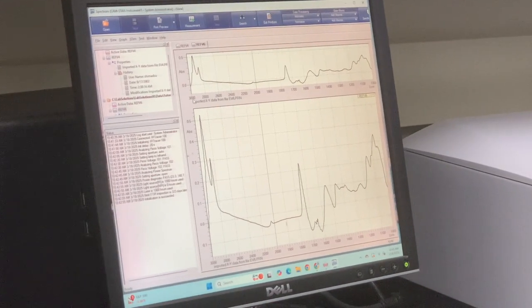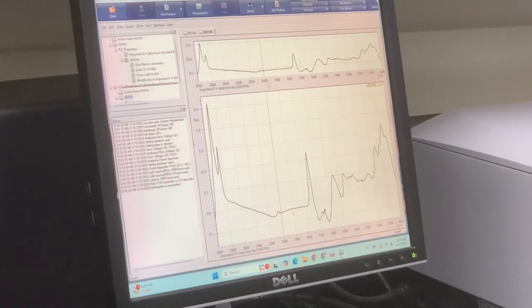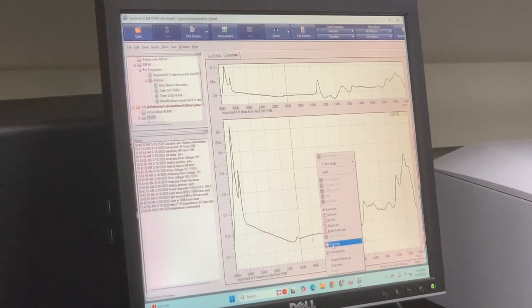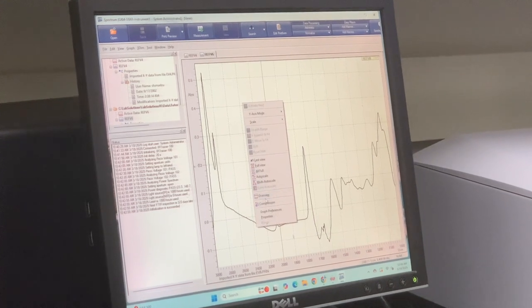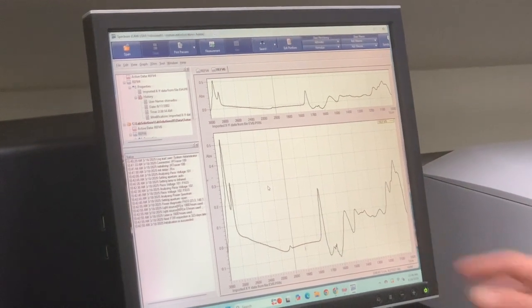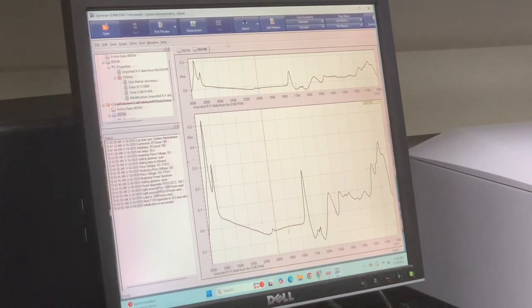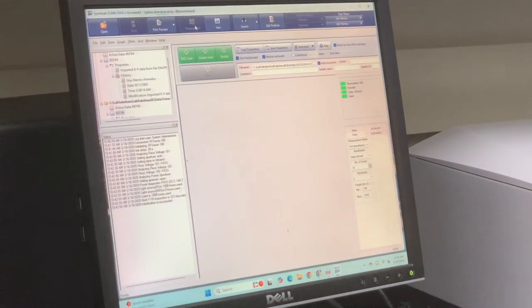Let's see, what else? Of course, your scale is down here, with your water peaks and stuff over here, or OH peak, I guess that would be. Let's see, they should have an overlay feature. Okay, overview looks like it's going to be that top part, that's what they're calling it. So this is the overview, meaning the whole spectra, and then you're zooming in on a portion of it. Right now this is the view window we're on, and if we wanted to take another measurement, we would have to click back to measurement. It takes us back to the measurement side.